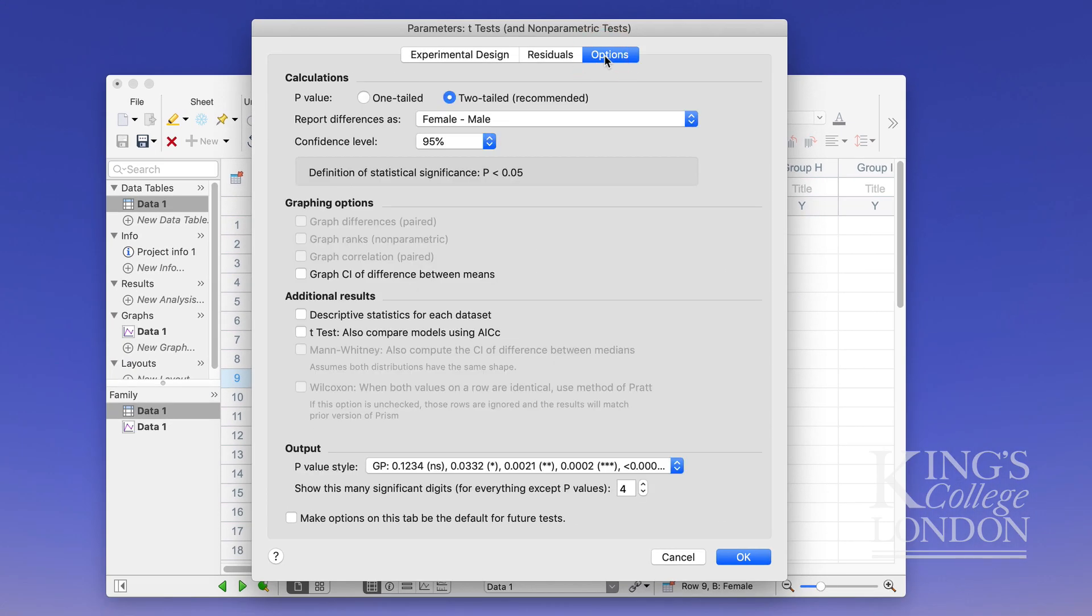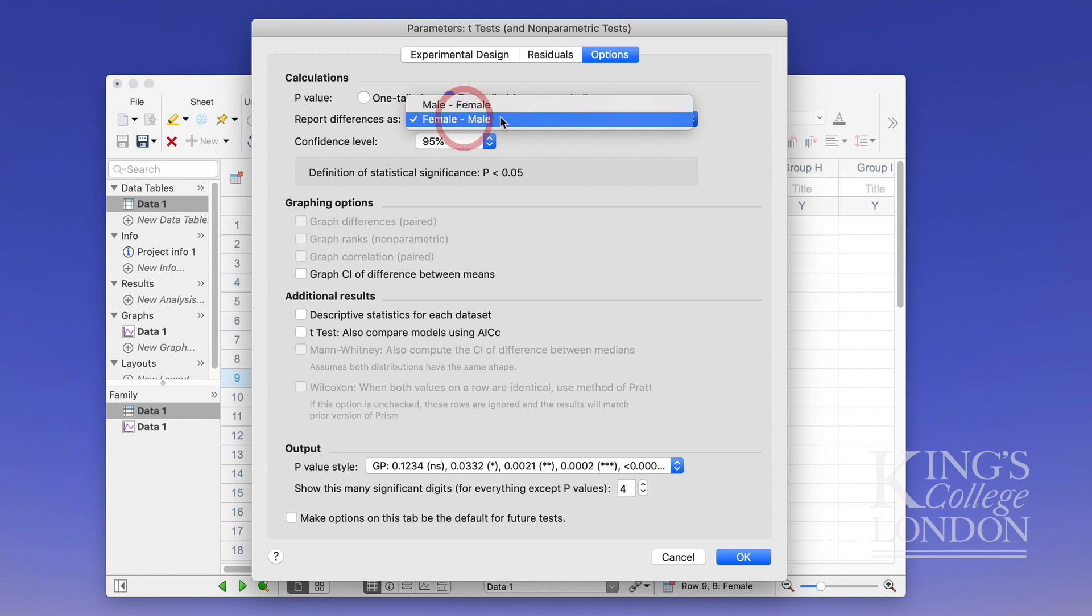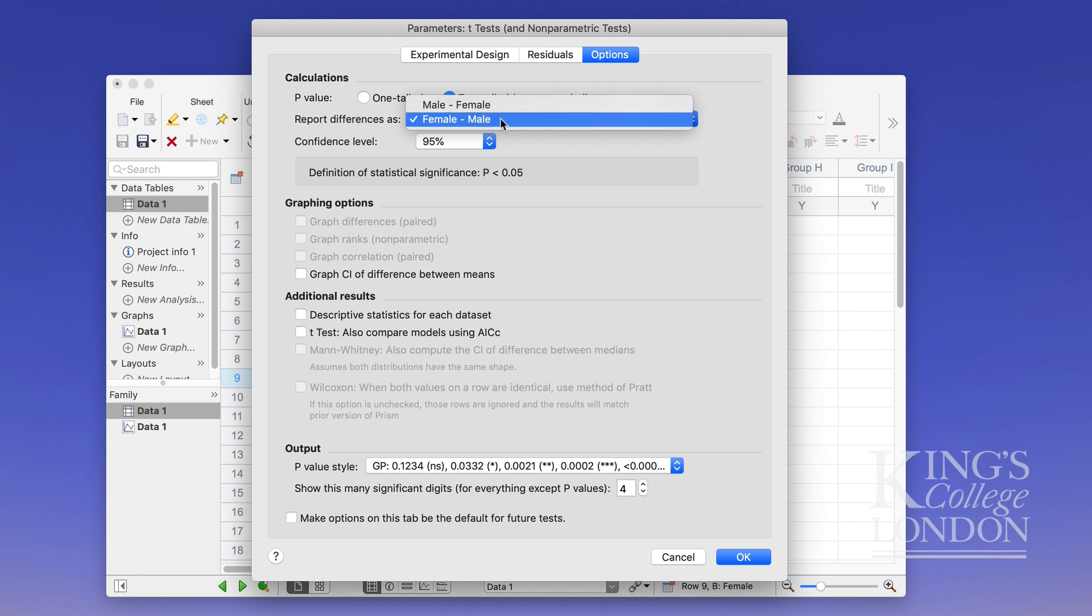In the options also you can report differences as male versus female in this case or female versus male doesn't make much of a difference.